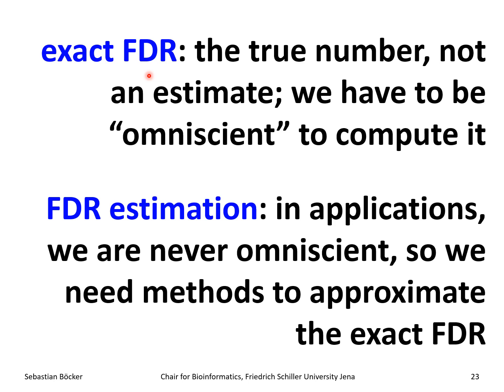And that means we are talking about the true numbers, not estimates. We have to play God to calculate those numbers. We have to know the correct answers to do that. We can only do that for reference data. But then how are you going to evaluate your methods if not on reference data? You don't tell the method what the correct answer is, and then you see how well the method behaves. That's what we do all the time when we evaluate CSI FingerID or Canopus. Okay? And this is true here too, so we can actually compute those exact FDRs.